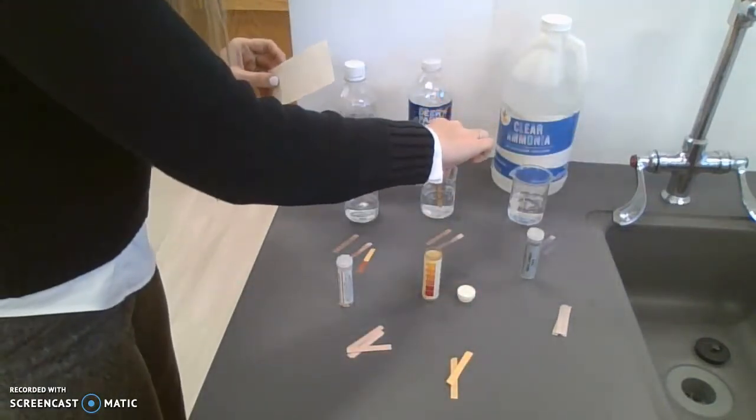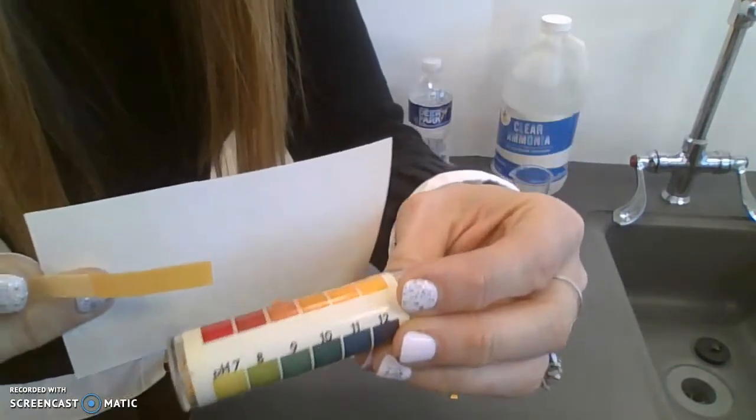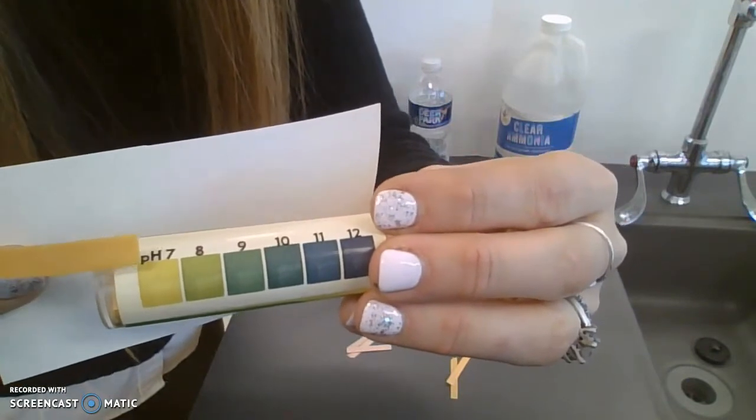Yellow litmus in water stays this yellowy color, so it's close to a pH of 7, which water is neutral.